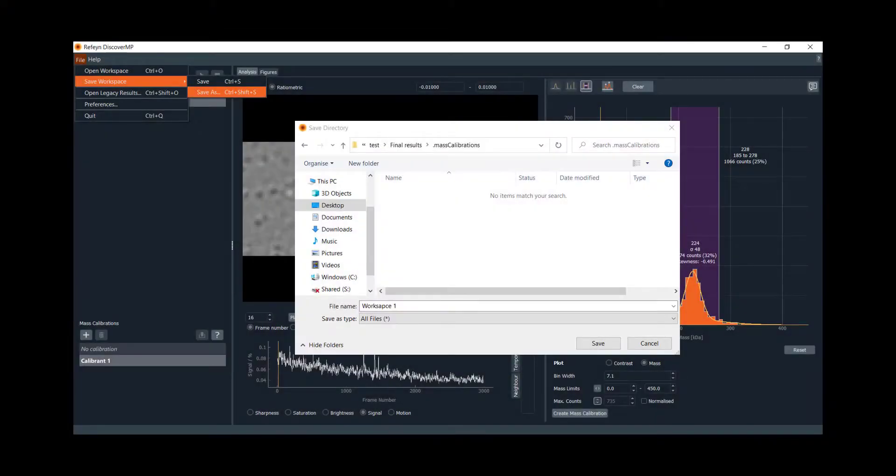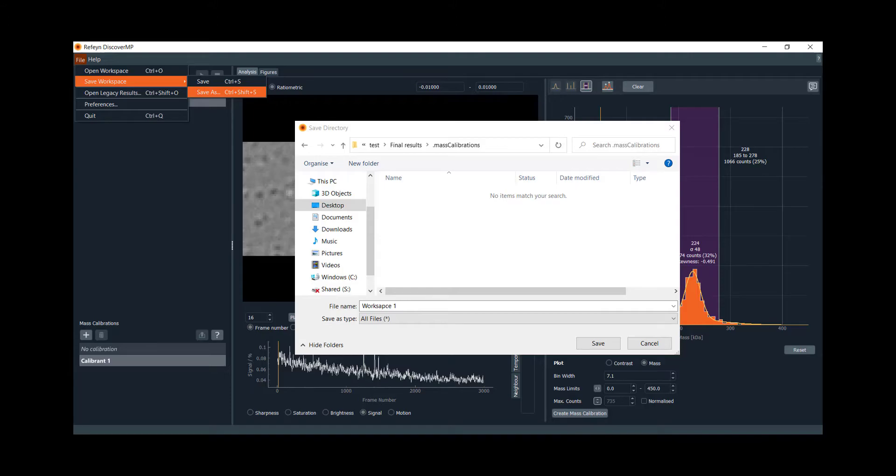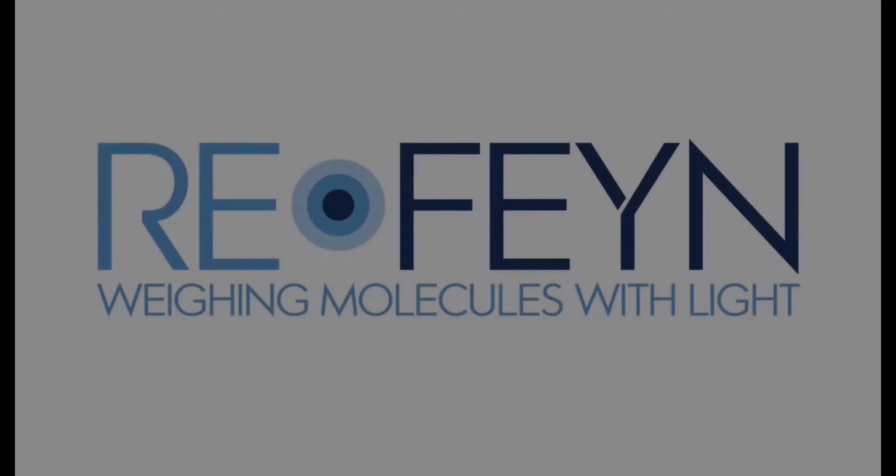An entire workspace containing all the data analysis, mass calibrations, and figures can be saved in one go and reloaded in Discover MP at a later time.